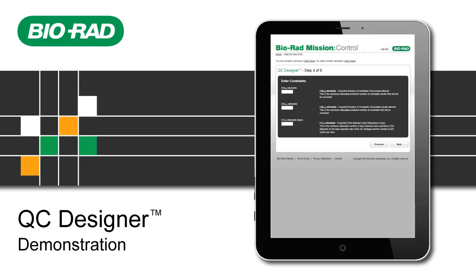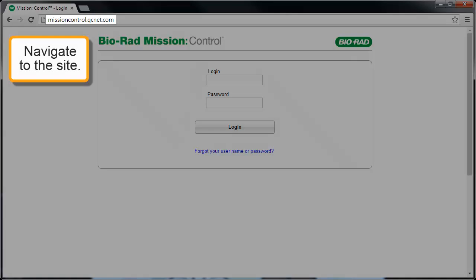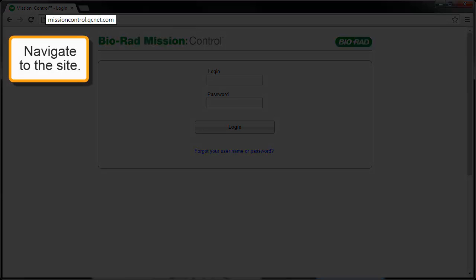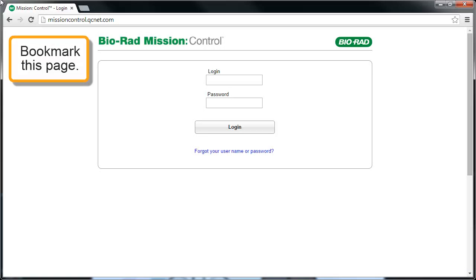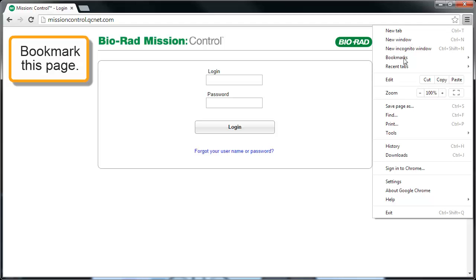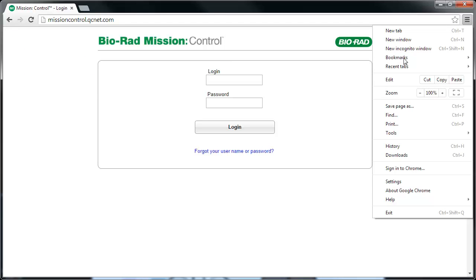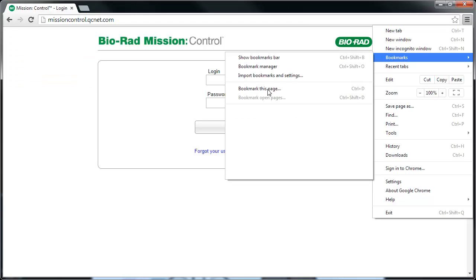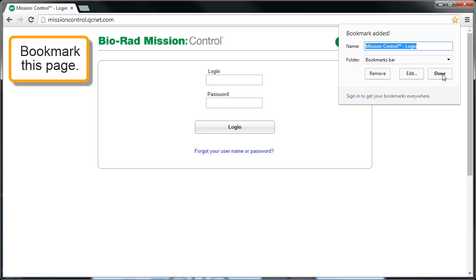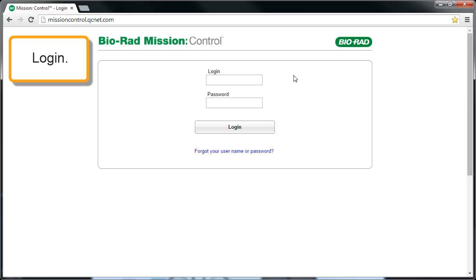Welcome to a demonstration of Bio-Rad's QC Designer. Go to missioncontrol.qcnet.com and bookmark this page so that it's convenient for future access. Enter your username and password.